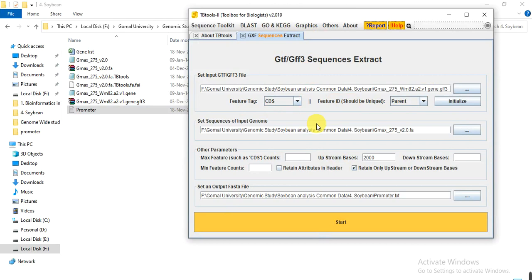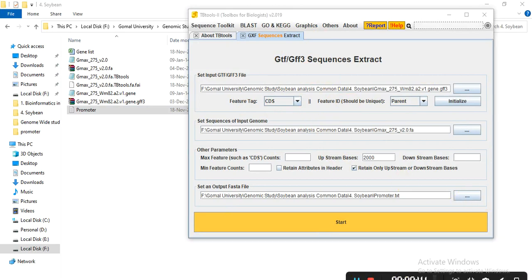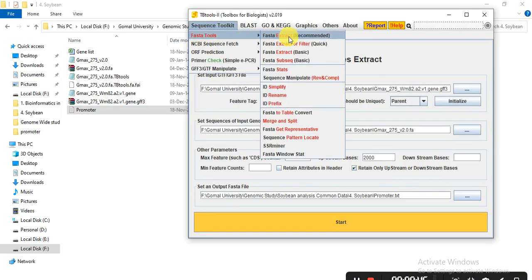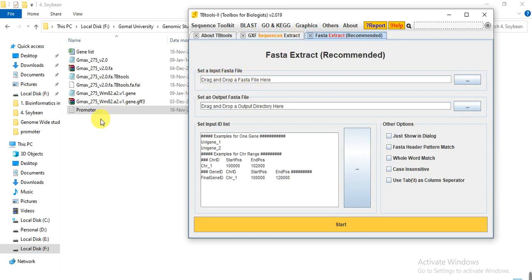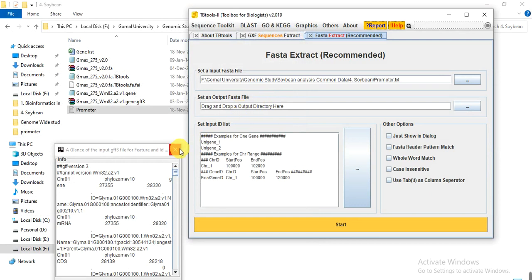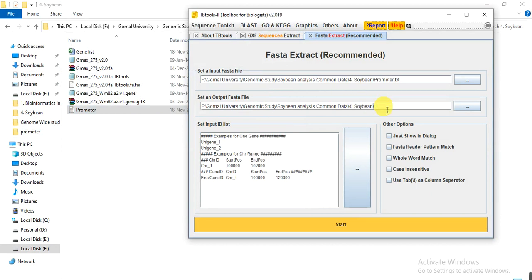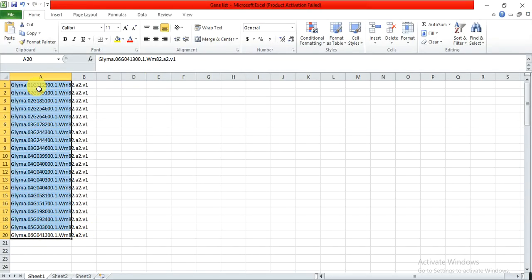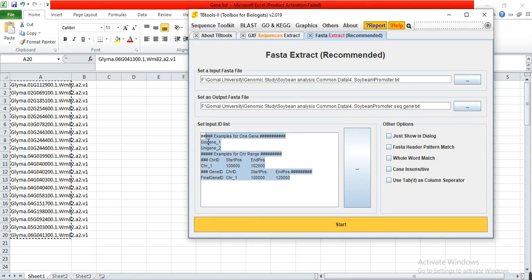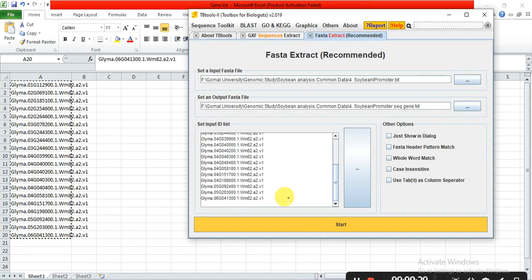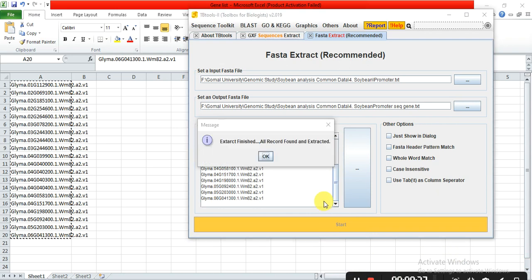Now go to TB Tool, then FASTA Toolkit, then FASTA Tools, then FASTA Extract. In the input box, give the whole-genome promoter region file we just made. Provide the output directory, and give the output file name — for example, 'promoter_seq_gene.txt'. In the gene list box, provide your list of study genes. Then click Start. When extraction finishes, you will receive the message: 'Extraction finished — all records found and extracted.'